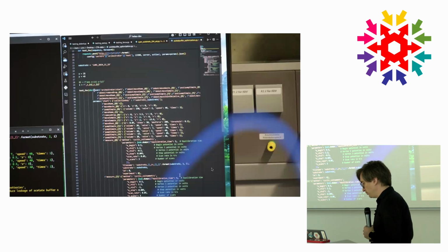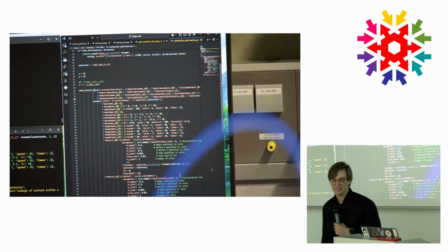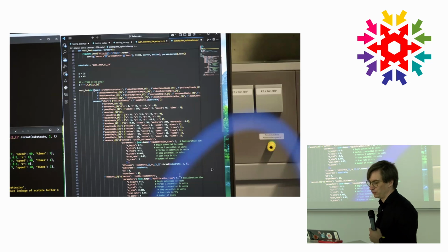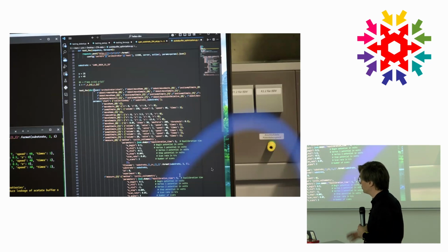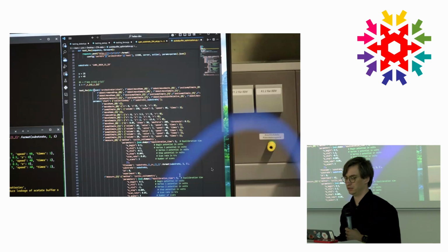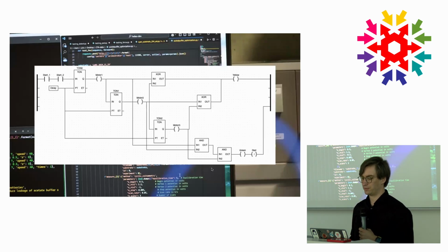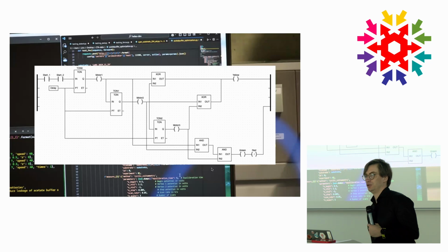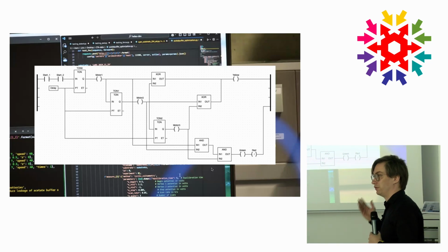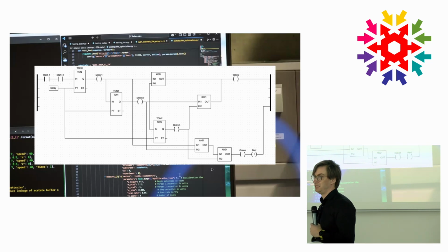The big problem with all of this, and this is just some code that runs the scanning droplet cell, is that it becomes complicated and relatively slow. Up until now, 100% of the code that my group is writing is in Python. The only issue is once you need to talk to hardware that is more on the industrial side, your programming looks like this. This is not LabVIEW. This is a ladder diagram. This is one of the IEC normed programming languages. Python is not, C is not.